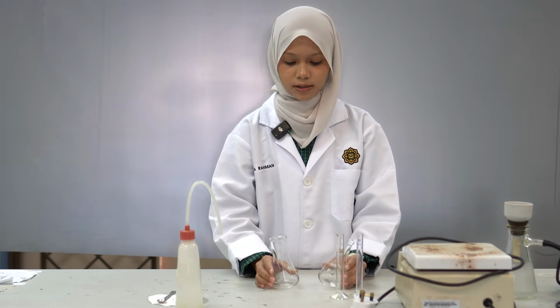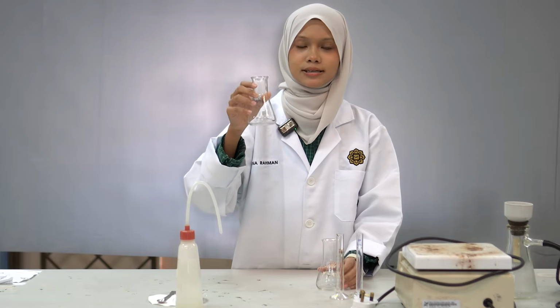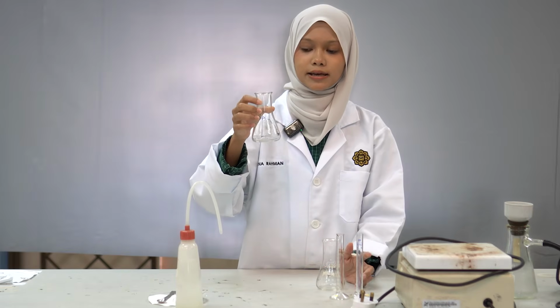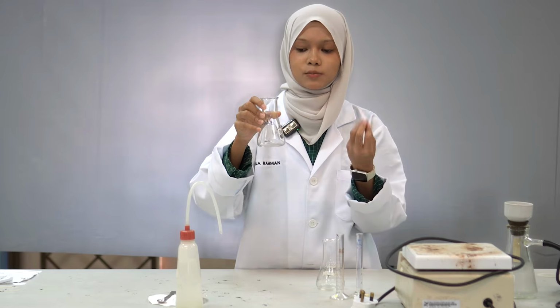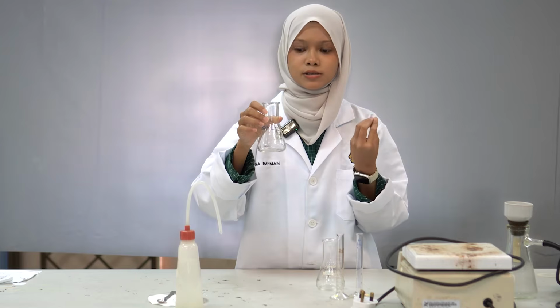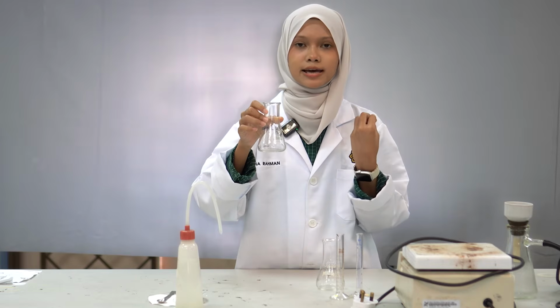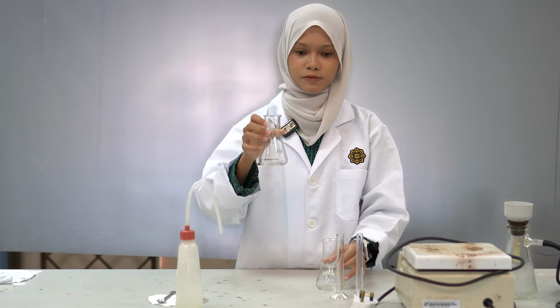So for the single solvent flask, we're going to see that the crystal produced is clearer, more beautiful and larger because of the cooling process that we use. It gives the acid molecules time to align themselves perfectly.